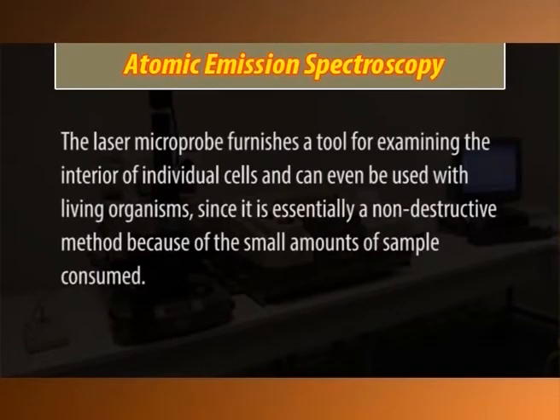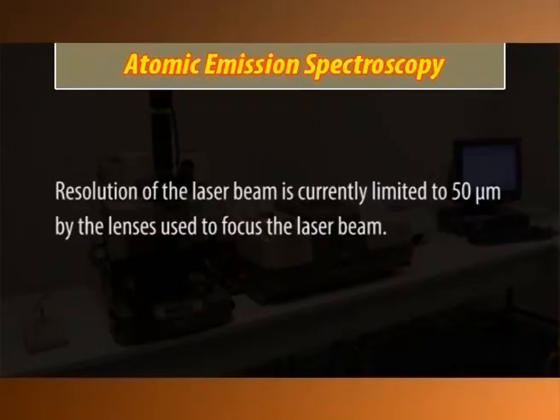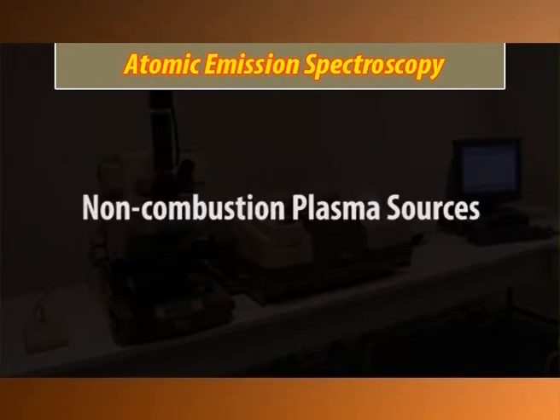The laser microprobe furnishes a tool for examining the interior of individual cells and can even be used with living organisms, since it is essentially a non-destructive method because of the small amount of sample consumed. It is also useful in analyzing the inclusion areas of alloys or corrosion spots on metal surfaces by those interested in these conditions. Resolution of the laser beam is currently limited to 50 micrometers by the lenses used to focus the laser beam.